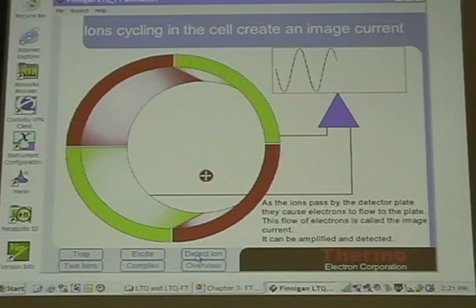So are they pulsed in, or is it just one open door, like if I said 1,000 milliseconds or 1 second for the IT? If you're at the right population so that it takes 1 second to fill, it just opens, the ions come in, and it closes. So that's basically the time that the door is open? Yep, that's all it is, the time the door is open. We don't compress the ions or anything. How close are we to things bouncing back out? If we did 5 milliseconds, everything would bounce out, right? Or 5 seconds, I think you're going to start losing things. It's not totally linear. You're not going to lose a ton.